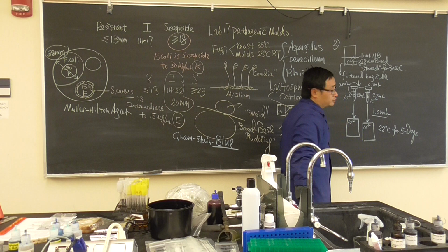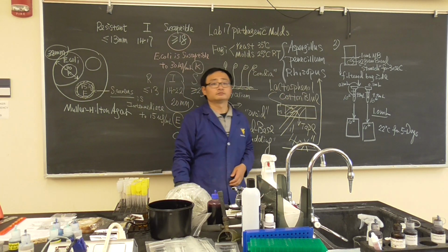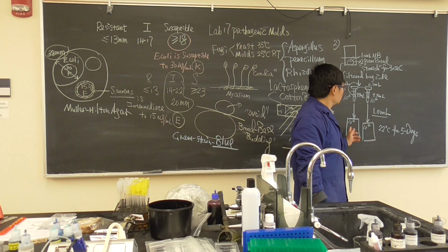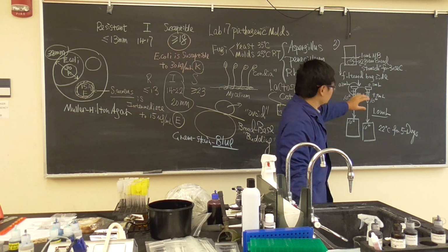You may be able to count, you may not be able to count. It really depends how bad the bread looks. So we will see how bad it is. Because it's very moldy, we do it in pairs: 2 of you get 2 pieces and do a dilution, finish these 2.